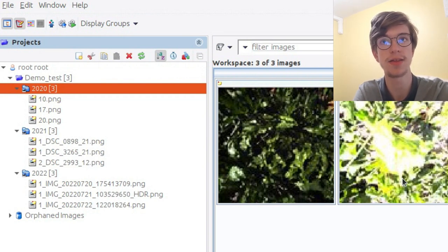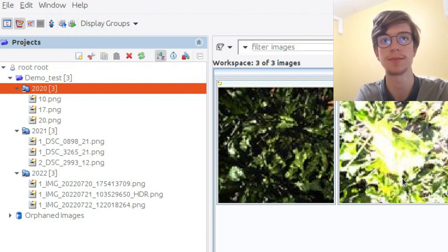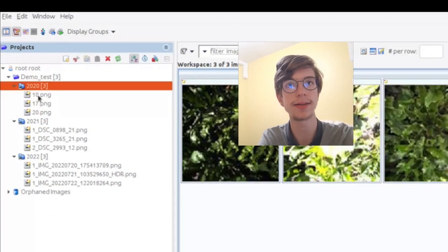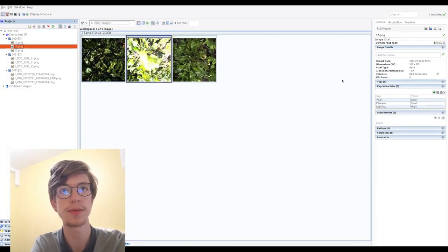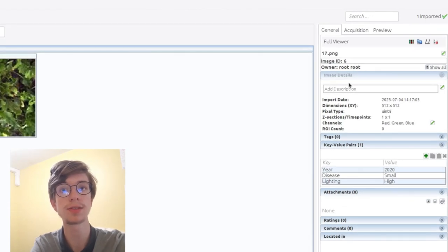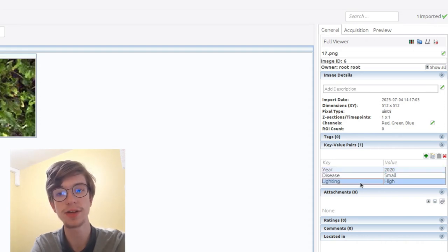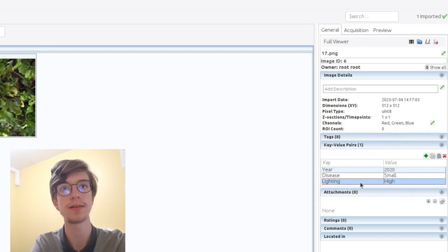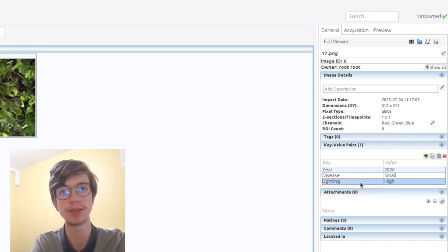In each dataset, there are images with beetroot disease as shown before. When you click on one image, you can see some information about it, such as the name, the ID, and also several metadata, and especially key-value pairs, which we'll use a lot in this example, because it contains the year, the disease, and the lighting, as shown in the CSV file.